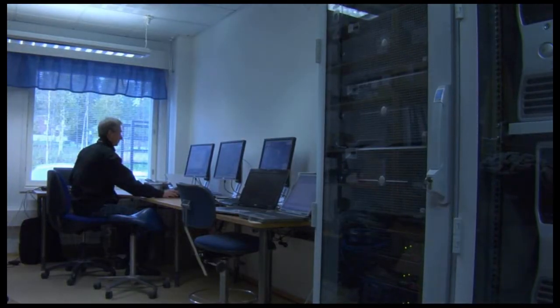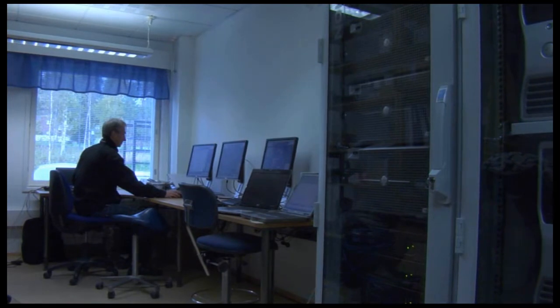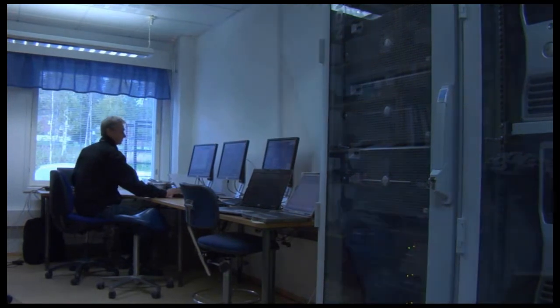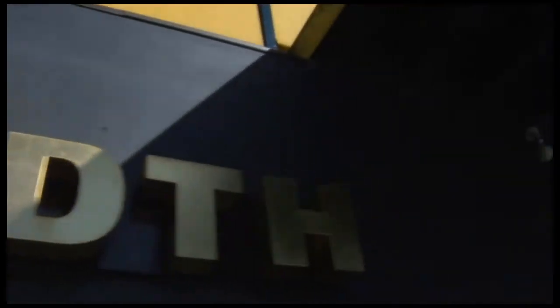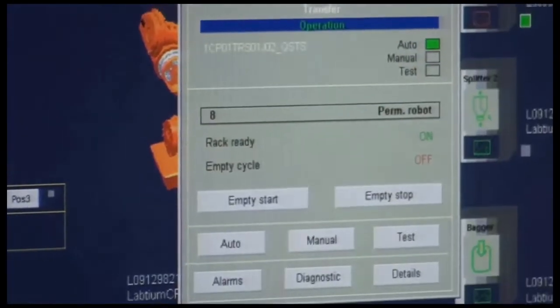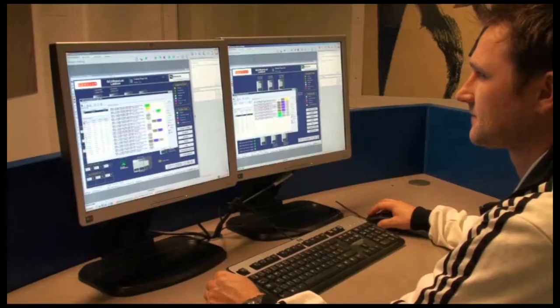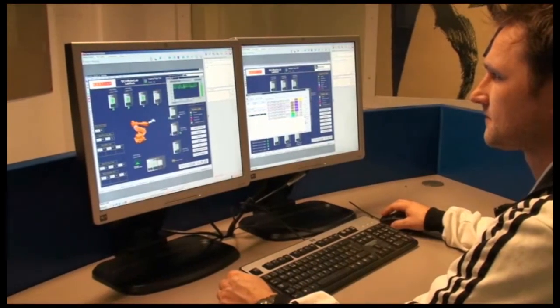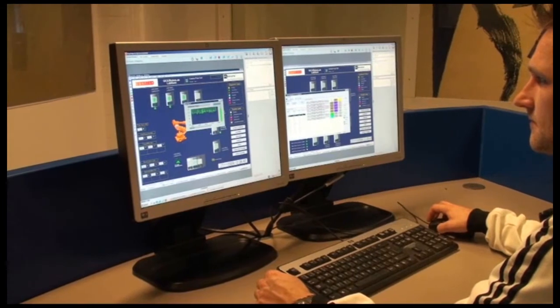From the engineering station, the maintenance engineer can supervise the system. And if he should get in need of assistance, he can call one of FL Smit's local offices or its regional technology centers in Denmark, India and the USA and allow them to log on to the system and assist him online. This secure and advanced remote support solution is very valuable as an additional security when the system is new and when 24-7 operation is crucial.